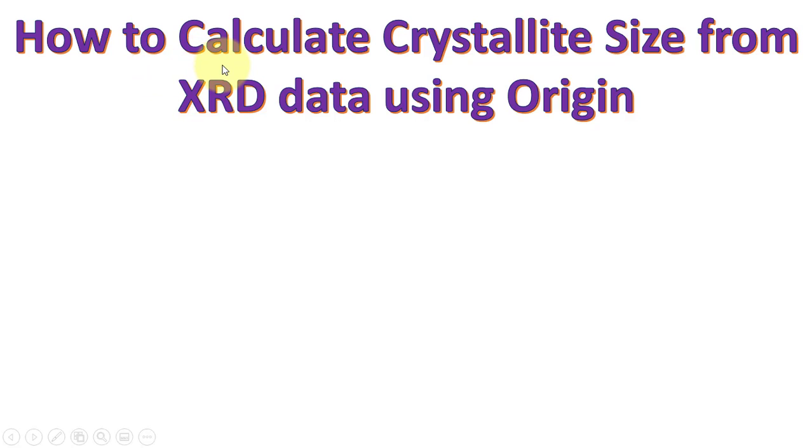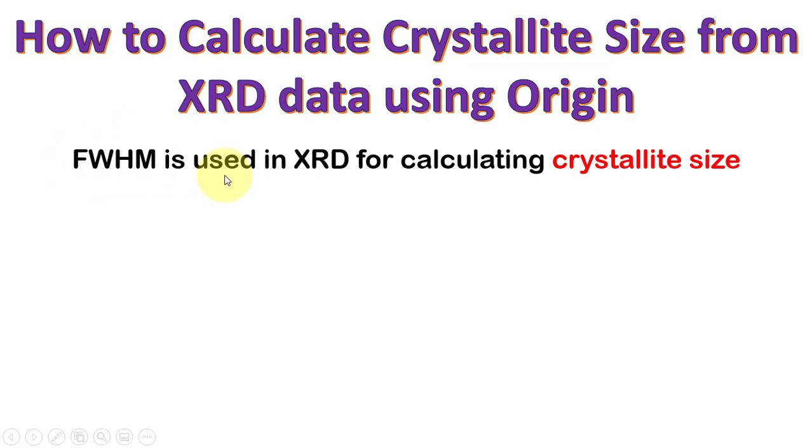In this video we will discuss how to calculate crystallite size from XRD data using Origin. From the XRD graph we will calculate the full width at half maximum and then utilize this value to calculate the crystallite size.